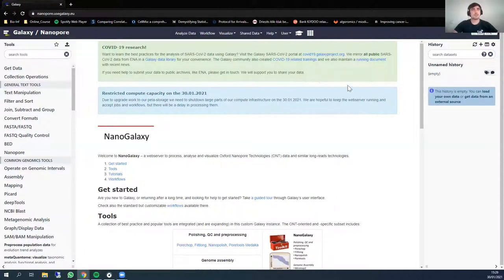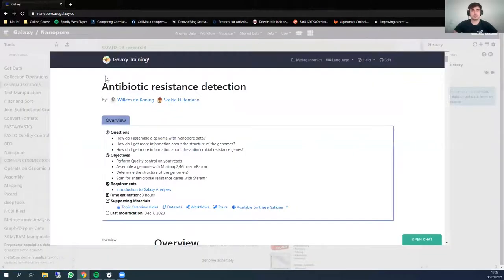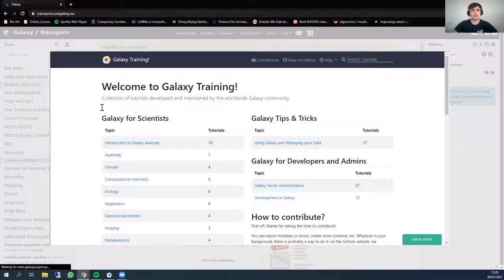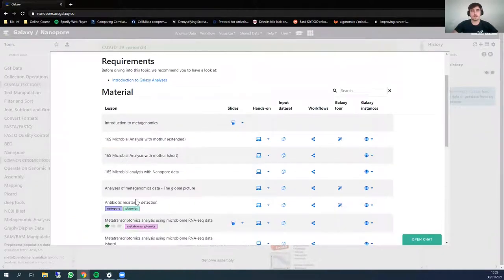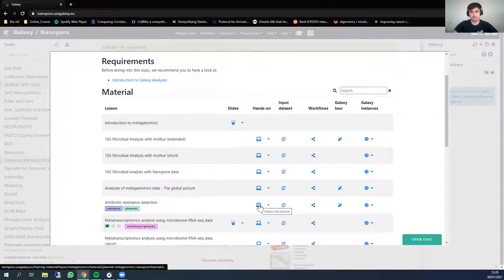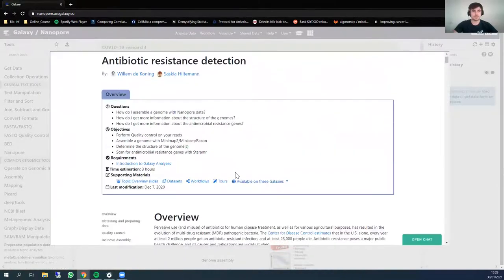First I will open the tutorial which you can find here. This is the starting page and for this specific tutorial you have to go to metagenomics, where you find the antibiotic resistance detection. As you can see, we will use nanopore data and we will see some plasmids. In this video I will go through this tutorial.